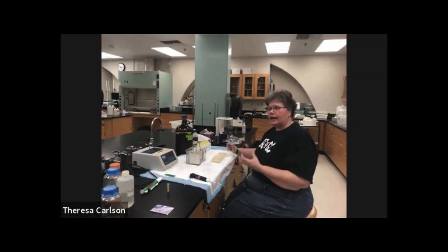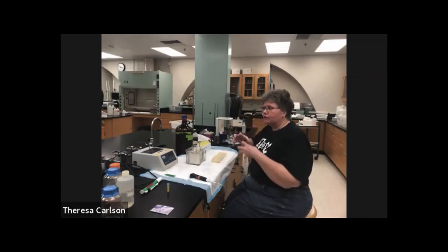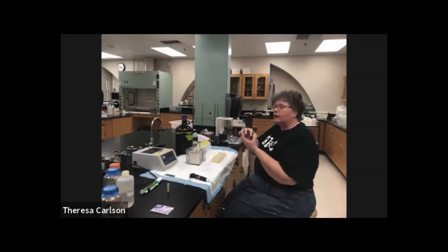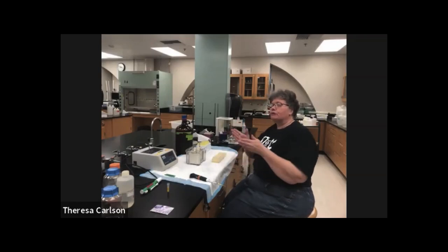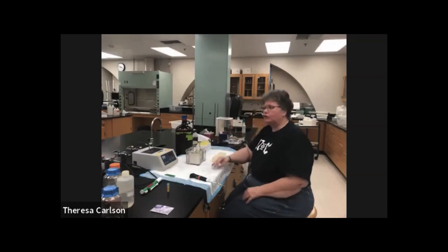Now, our sample buffer contains a high concentration of beta-mercaptoethanol, and that high concentration of beta-mercaptoethanol completely takes apart any disulfide bonds and linearizes our protein. Additionally, there's SDS in there. We want to completely coat our proteins with SDS so that we have that constant charge to mass ratio. If you don't remember the constant charge to mass ratio, please refer to the lecture on Aldolase where I talk about the constant charge to mass ratio and how SDS is going to help all the proteins become negatively charged so that they will go towards the positive electrode in the gel assembly.